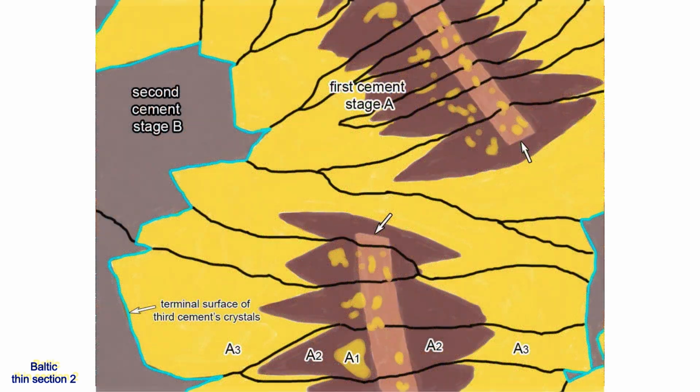The bivalve's prismatic calcite crystals are coloured light brown, with irregular yellow patches that cross crystal boundaries, likely due to recrystallization. The first cement A increment, labelled A1 and coloured dull yellow, occurs on the outer surface of the bivalve's prismatic calcite layer, but not on its inner surface, because when it precipitated, its aragonite was still present.